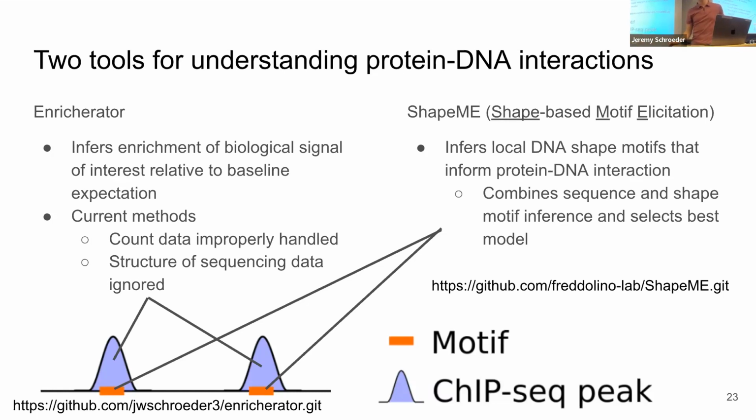So that choice, it is hard coded. And honestly, I didn't put that much thought into the width of that prior. And I really should, because for input DNA, we really don't expect massive changes, the type of wide changes that prior explicitly denotes we're expecting. So I probably should narrow that down to something that's better supported by experience with these types of data. So for a bacterial genome, we'd expect 2 to 4-fold change across the genome if they're replicating their genome, and this prior far exceeds that kind of difference.